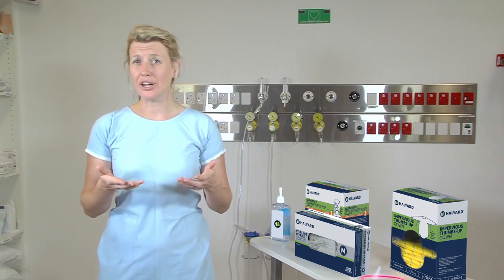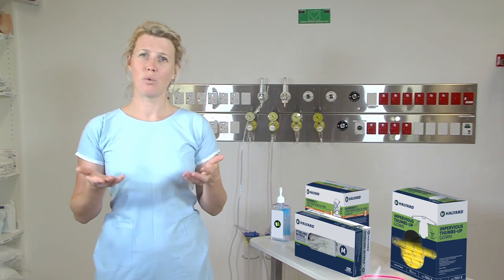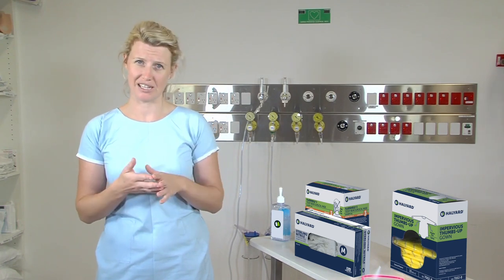Before you start putting on any kind of PPE, it's really important that you do some kind of hand hygiene — whether that's a hand wash with soap and water, or using an alcohol-based hand rub like what we're going to be using today.